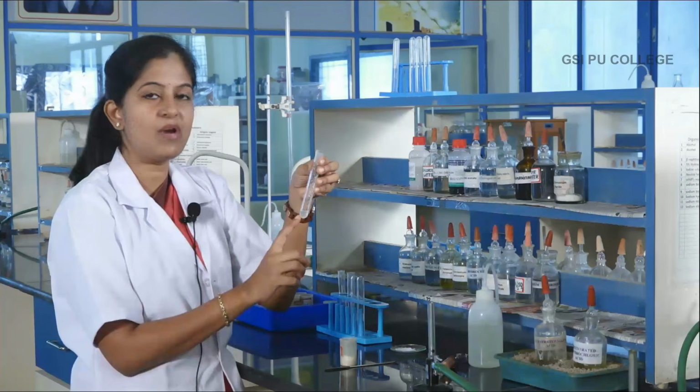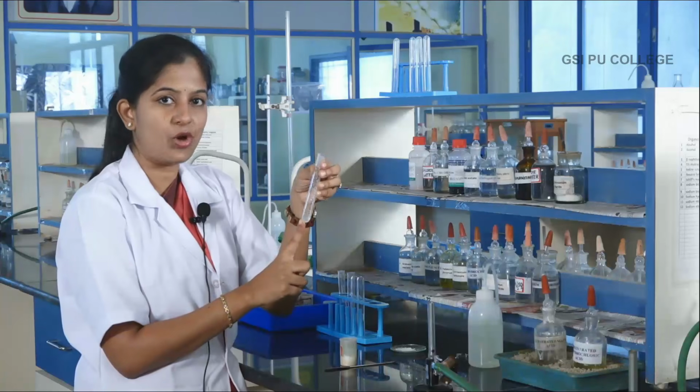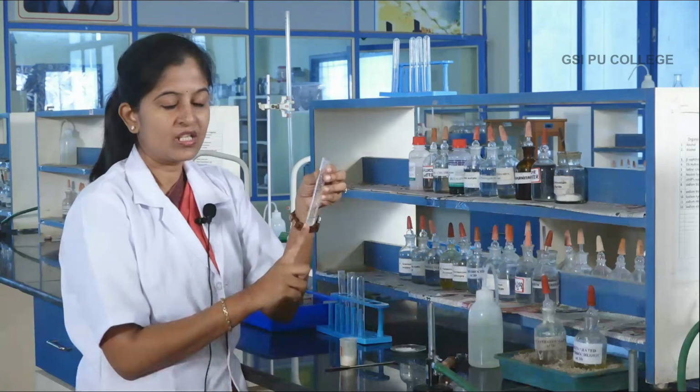But in the second group acid radicals there is nitrate also. Nitrate doesn't give a characteristic reaction at room temperature. So what should we do? You have to take concentrated sulfuric acid and the salt and heat it in the presence of copper turning. Here, instead of copper turning I am taking a paper ball since it reacts very easily compared to copper.